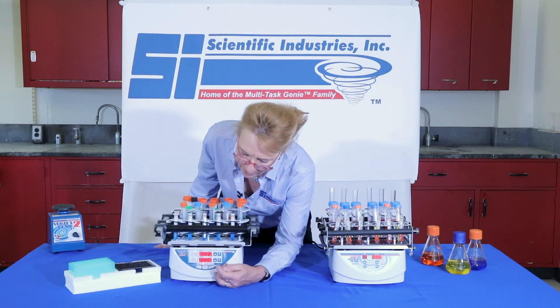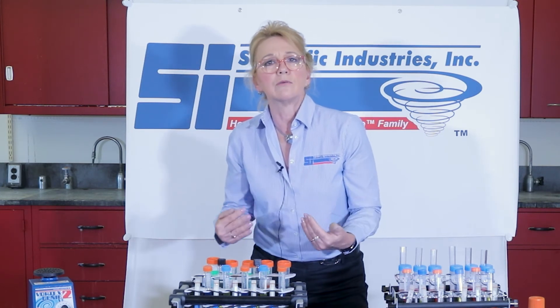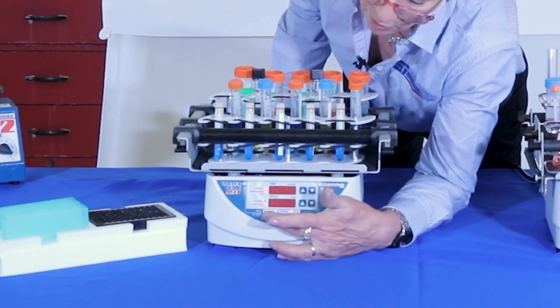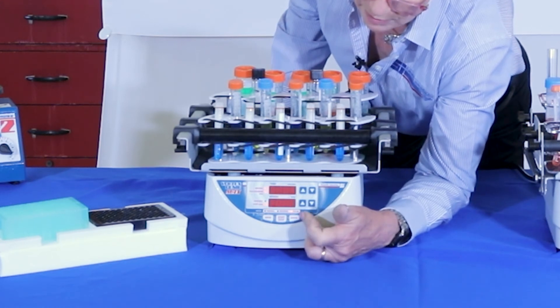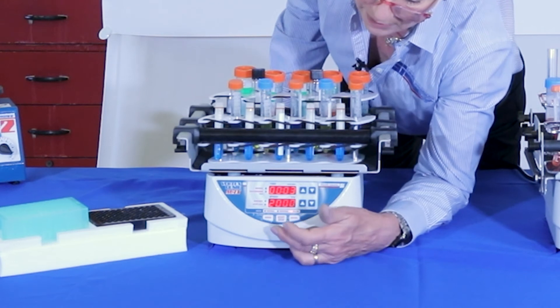Then we also have the pulse mode — this is a function that Scientific Industries has been utilizing in a number of pieces of equipment, including the Vortex Genie pulse and the digital microplate Genie, allowing for on and rest mode for total cycle time. We're going to press the mode button to light up where it says pulse, and we currently have it set for 4 seconds on, 4 seconds off.